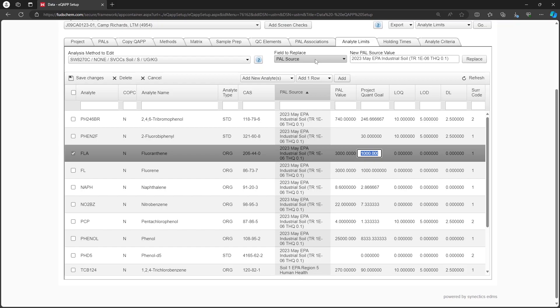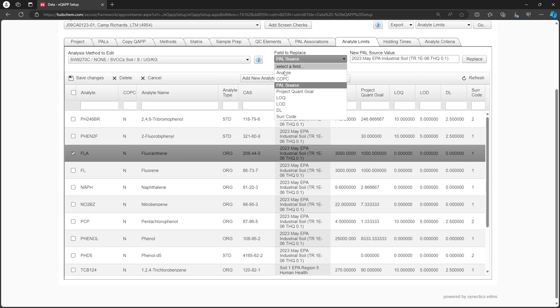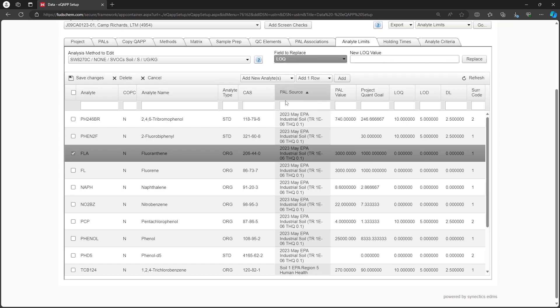The LOQ, LOD, and DL for the new Analytes should be provided by the lab. We could fill them out by typing into the cells, using the field to replace option, or using the export. For this example, we'll use the export.